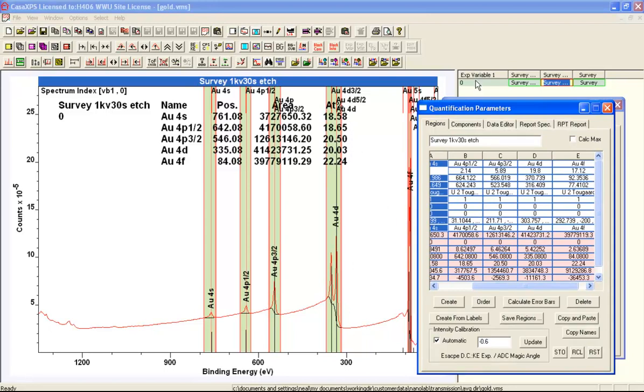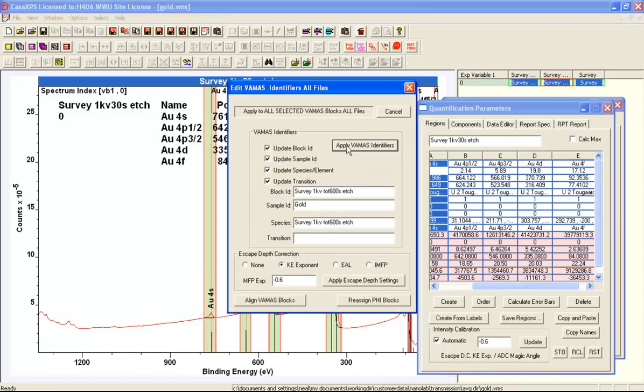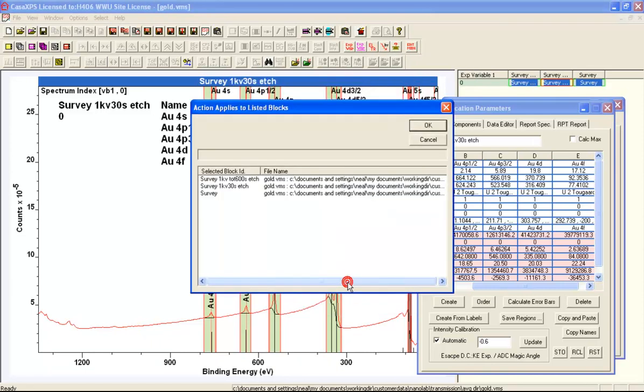Having done this, we'll now change the mode of correcting for the escape depth from a kinetic energy. We'll set using this dialog window, change it from the kinetic energy exponent to the effective attenuation length, and we'll apply that.